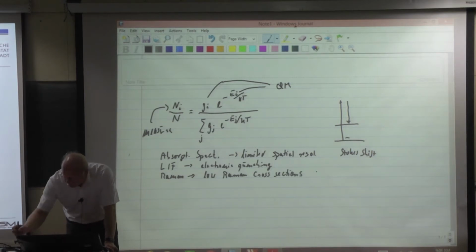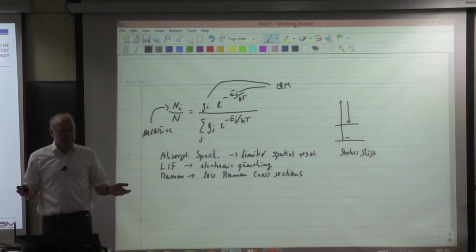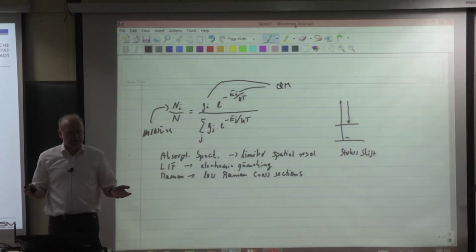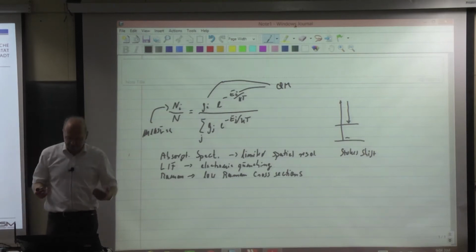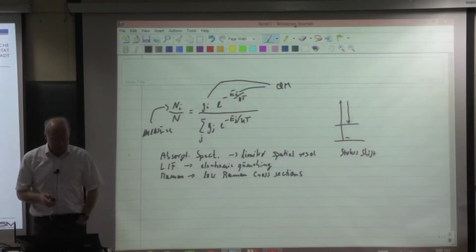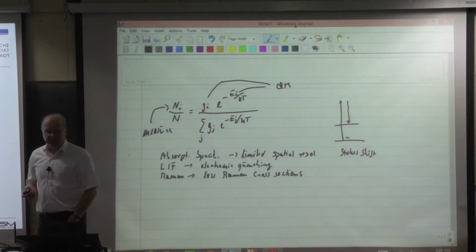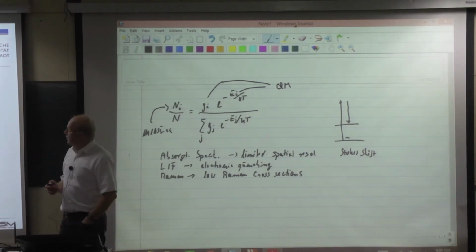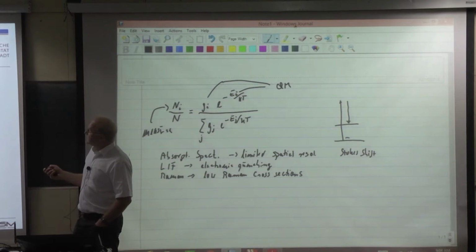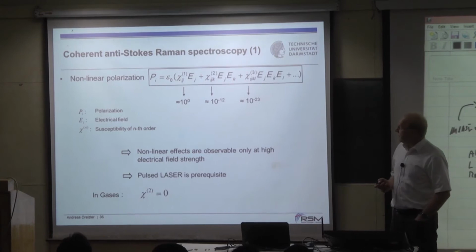The problem with Raman scattering actually is that you have extremely low cross-sections, Raman cross-sections. And so you have to overcome that somehow, and that means you have to have a sufficient number of photons, high energy, and you need very sensitive detecting units to get as many Raman photons as possible. Okay? And so I would like to continue now with the last technique that is referring to the Boltzmann distribution function, which is now a nonlinear technique that needs a bit more explanation, I guess.